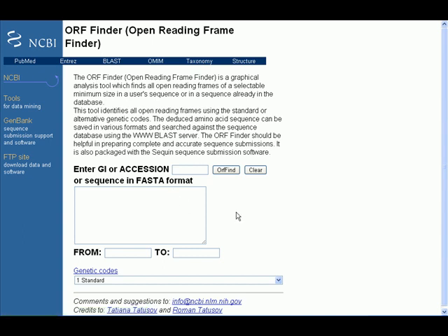They say here that the ORF Finder or Open Reading Frame Finder is a graphical analysis tool which finds all open reading frames or possible coding regions.